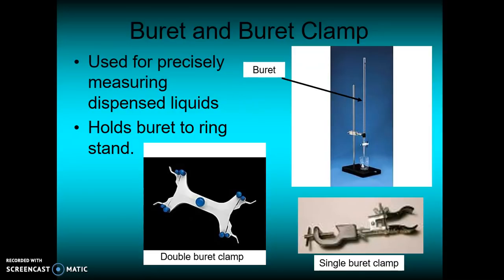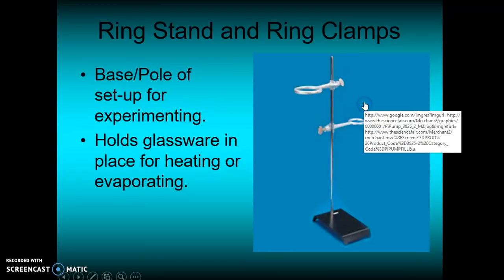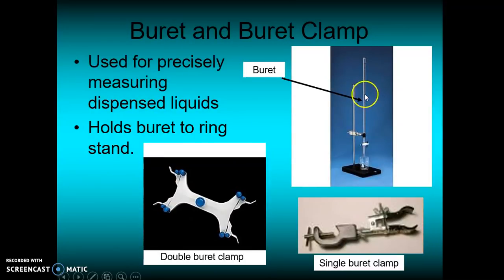So when I say in the lab that you will be using 10 milliliters of water to mix with a chemical or in any experiment, you use these Burets, and we'll see how to use these. You can see a little stopper over there. So you open it, and precisely the water or whatever you're using to measure is going to go down. You look for the markers and you measure the liquid precisely in there. I'll be discussing more about that in the class.